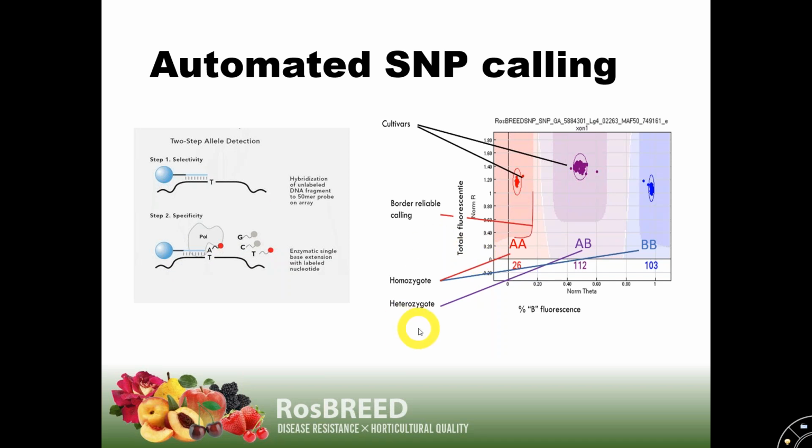And so that leads us to GenomeStudio, and I'll come back to this again, but for the next slides you need to have a little bit of an understanding of what the output looks like. So this is the output for a single SNP, and it shows the intensities that were recorded for this SNP over many individuals, and each dot in this plot is a single individual. So you can already see that the individuals group in 3 clusters, as is expected, because we're expecting 3 genotypes.